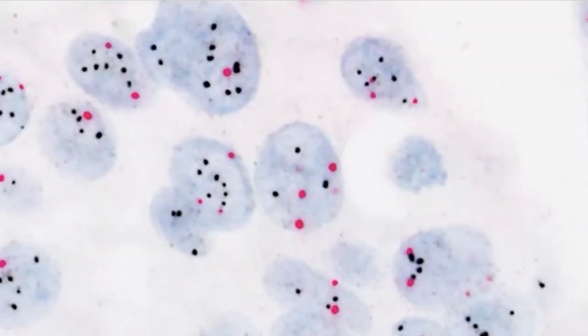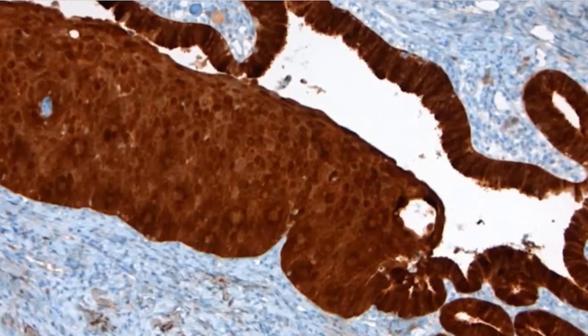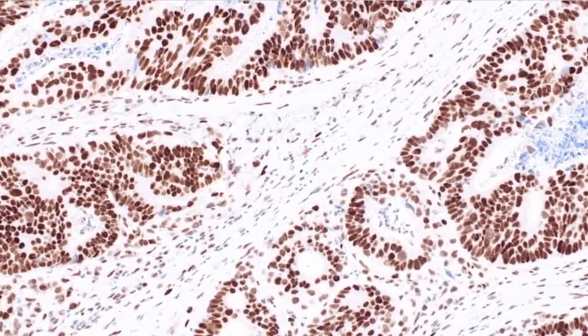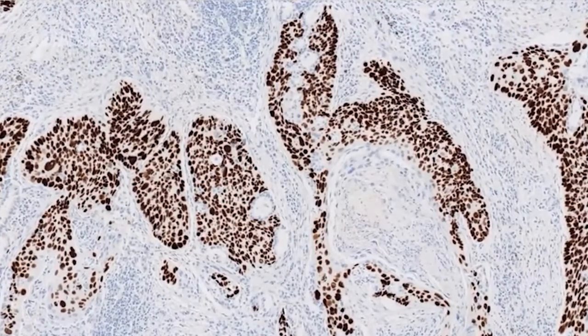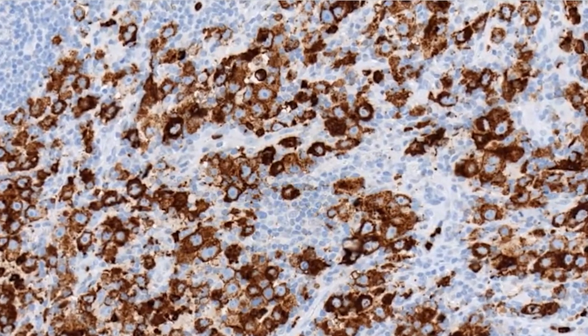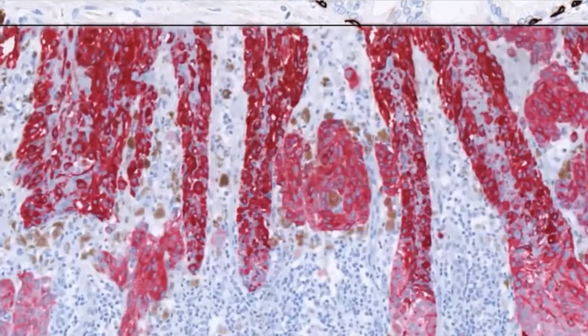By measuring the fluid on the microscope slide in real time, one could better understand the staining environment and carefully monitor the staining process. This is where the project is mainly centered, since this is where we have to incorporate our design.